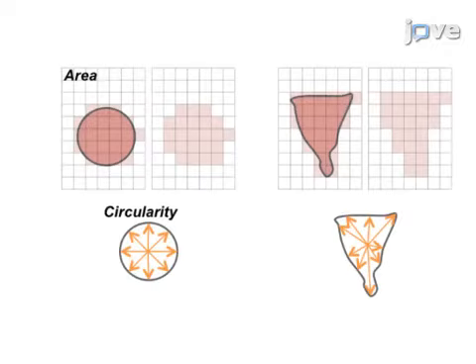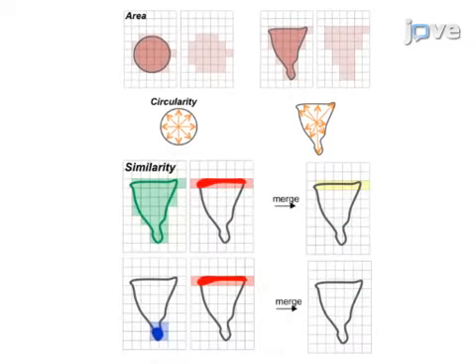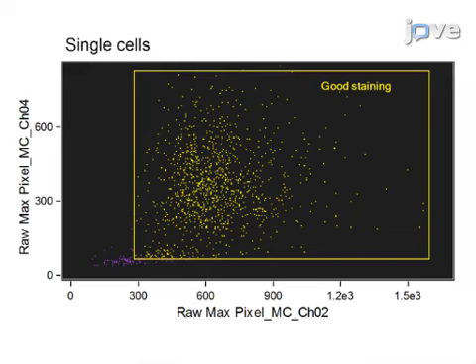In the final step, the number of morphologically polarized lymphocytes and the amount of segregation of the fluorescent markers can be evaluated based on the location and the intensity of the pixels for each staining, depending on the chosen mask. Ultimately, this imaging flow cytometry technology can be used to rapidly and robustly quantify the morphological changes of lymphocytes after chemokine stimulation, as well as the location of specific proteins of interest within the polarized cells.